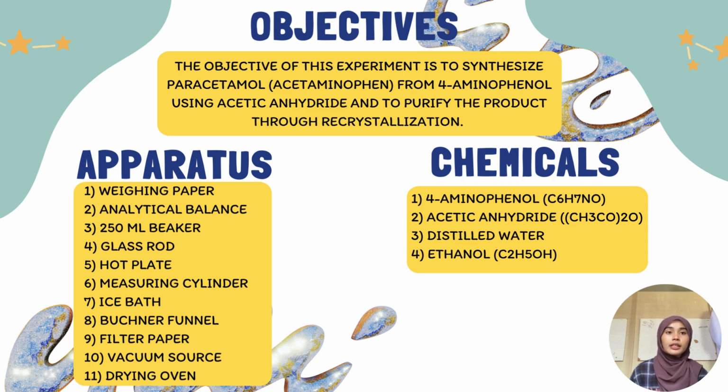Next, the chemicals. Firstly, para-aminophenol. Secondly, acetic anhydride. Third, distilled water. And last but not least, ethanol.